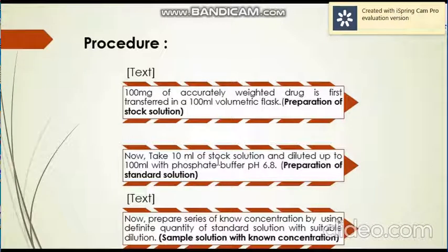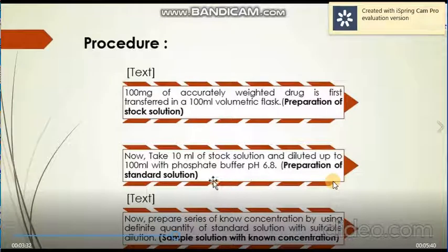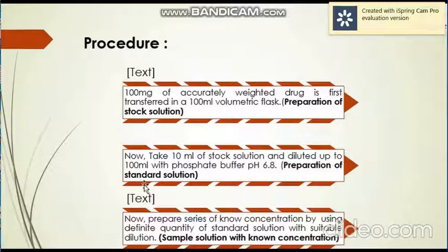Thereby sample preparation can be done in the last stage, where we have to take only an adequate quantity of sample like 1 ml, 2 ml, and then that sample can be utilized for further dilution to prepare the final concentration mark.